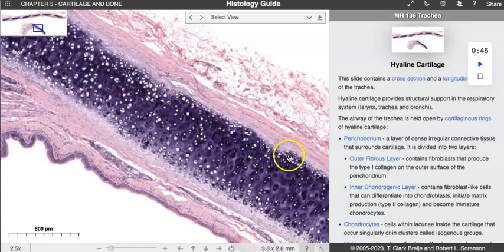As you get to the periphery, a lot of students will say, well, is this where I would find those chondroblasts, right? Chondro is cartilage, blast is a cell that is actively making the product, right? And actively making cartilage in this case. And the chondrocyte, again, a cartilage cell, but it's more in an arrested, mature phase. And that's when we would see that the cells have a lacunae around them.